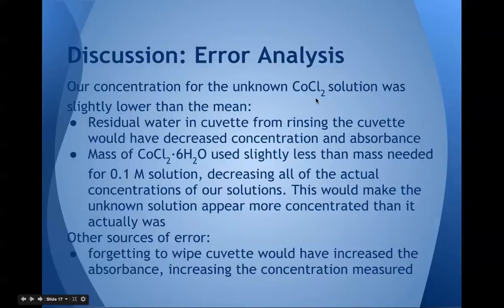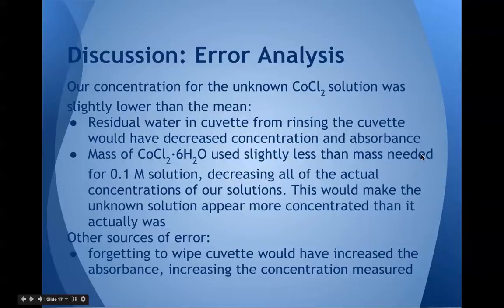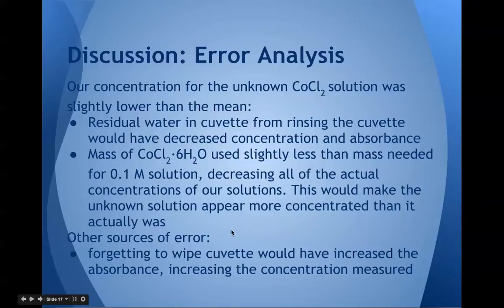Error analysis: A couple of factors that could have caused errors were residual water in the cuvette from rinsing, which would have decreased the concentration and absorbance of the solution. Or the mass of CoCl2·6H2O used was slightly less than the mass needed for the 0.1 molar solution, which would decrease the actual concentrations of our solutions and also make the unknown solution appear more concentrated than it actually was. Another source of error could have been forgetting to wipe the cuvette, which would have increased the absorbance and the concentration measured.